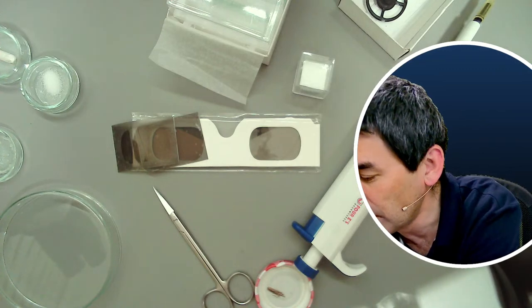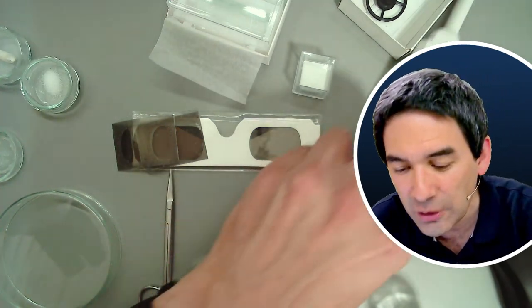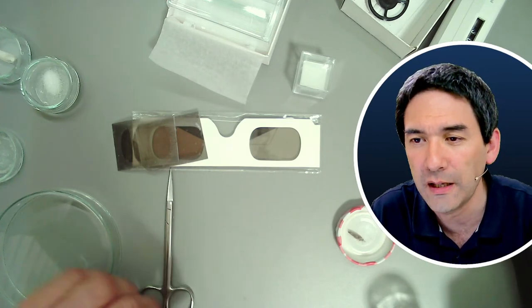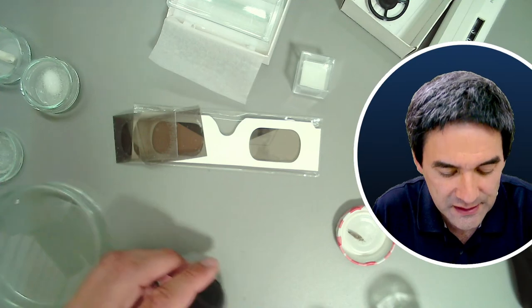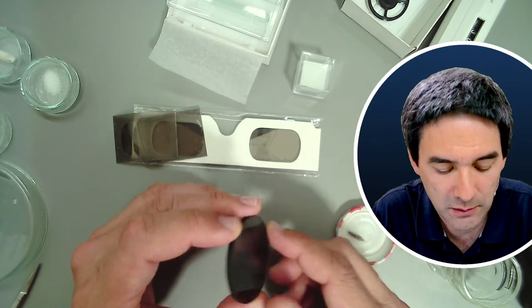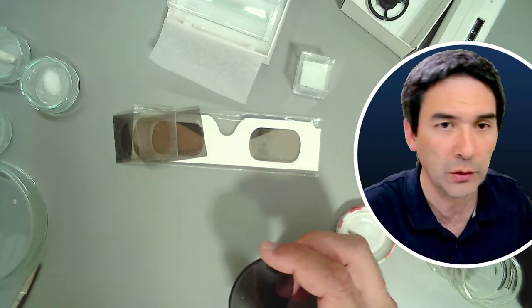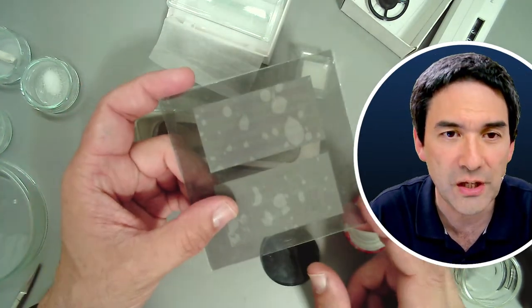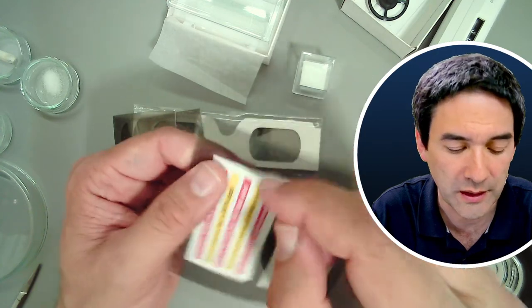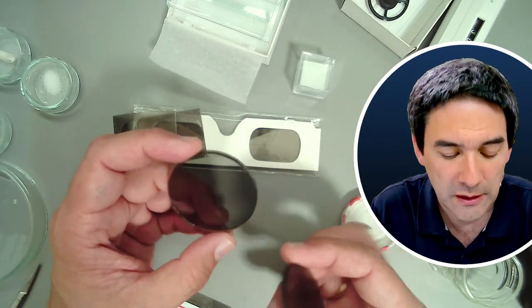Some of you might already know this, but for those of you who don't, I'm going to give you a quick explanation of what polarized light microscopy is and how you can try this out yourself. What I've got here is a so-called polarization filter. I got this from an old camera, but these days, what you probably want to use is the following. You can buy those polarization filters. Here it is, with a plastic protective foil on it. Basically they also work. They can be bought over Amazon. They're not so expensive. You can also use those filters here.